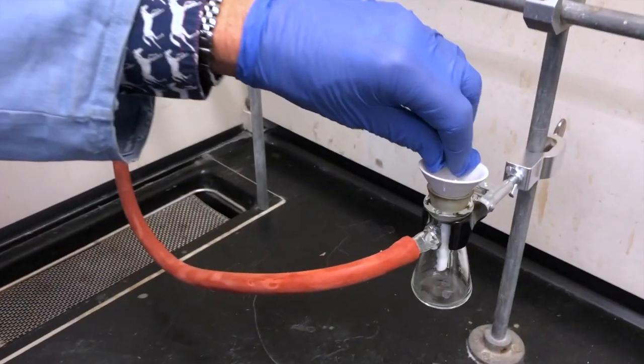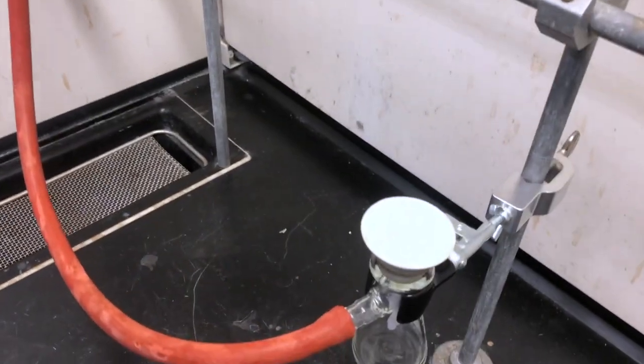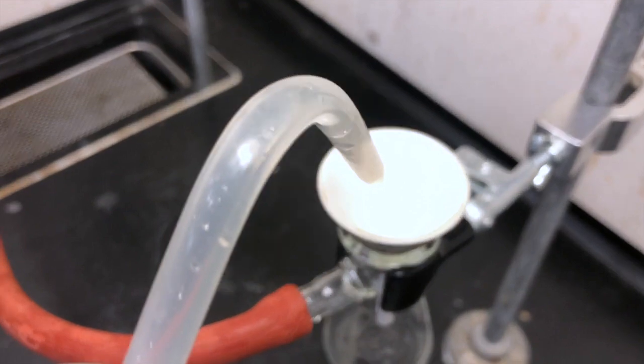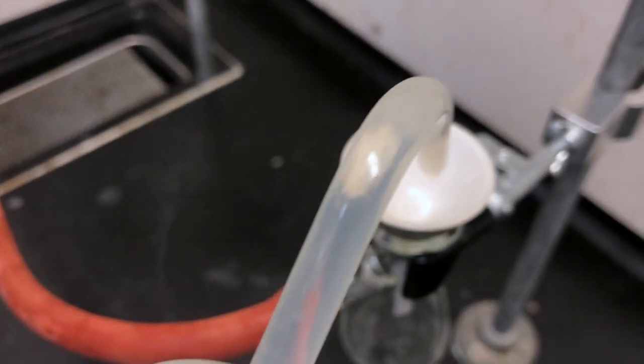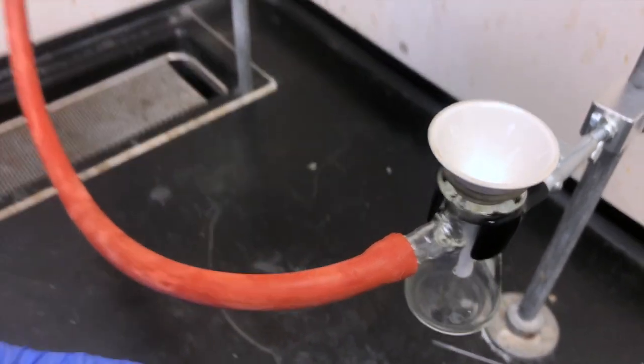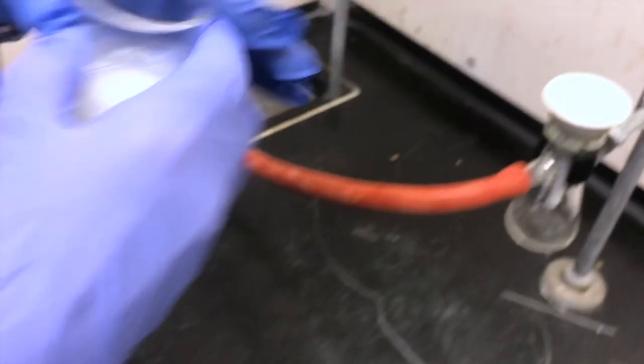At this point we can put our filter paper into the Hirsch funnel and we need to wet it slightly and suck a little bit of water through to hold the filter paper into place at the bottom. We want to block all the holes at the bottom of the funnel.